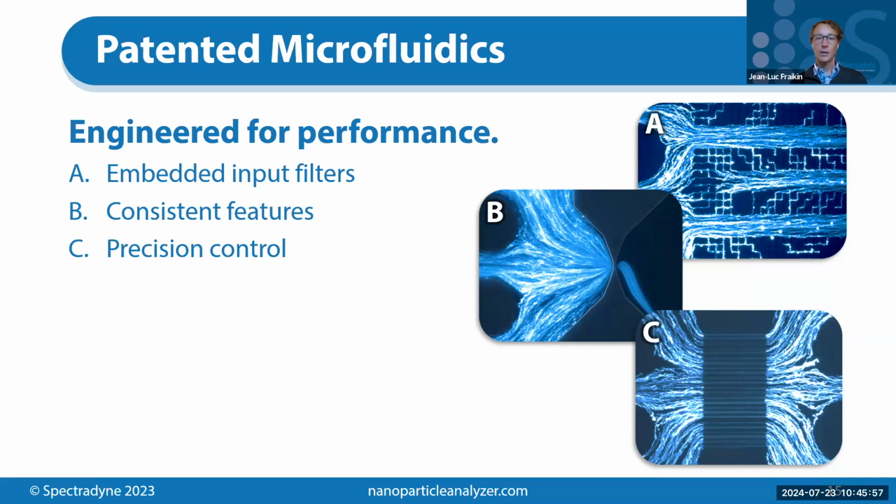Okay, one more question. Can I use unprocessed plasma and serum? I mean, essentially the data that I showed today was that. We remove the cells first though, but that's inherent to plasma or serum. And we do dilute it in PBS, I think tenfold usually, for measurement. So hopefully that answers your question, but otherwise there's no significant sample cleanup required for sample measurement.